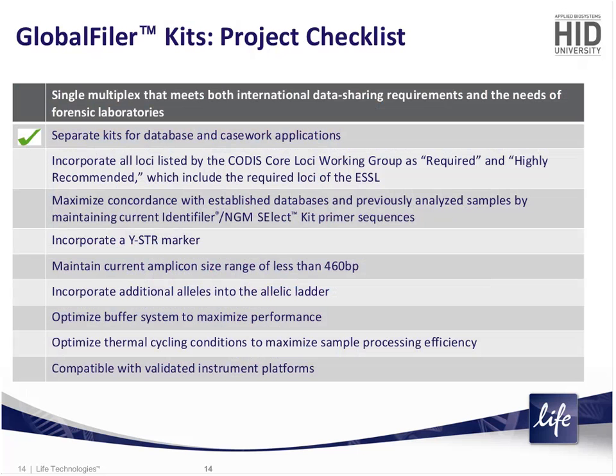So that's an easy one to check off. We know that we need to go down these separate routes to get those performance advantages, and so we separate the kits for database and casework applications.